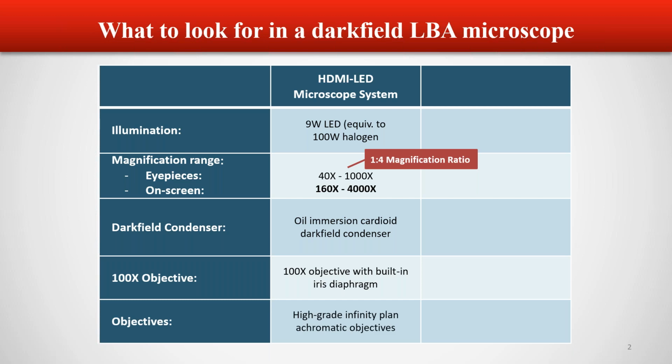Right, and so then that's lastly crucial, yes? Absolutely crucial, yeah. As I said, with our additional on-screen magnification, you would be using the 40 times objective for most of your analysis. You'll be able to identify all your live blood anomalies quite easily with the 40 times objective.